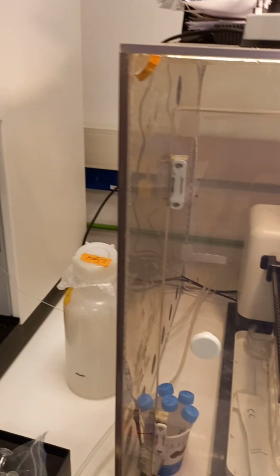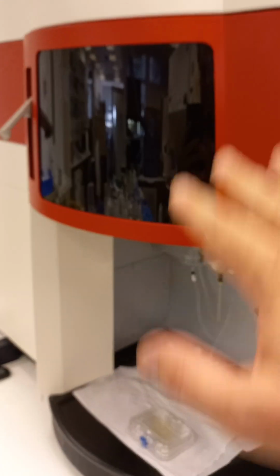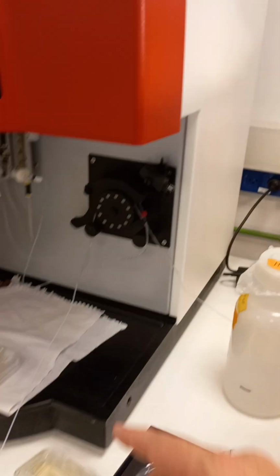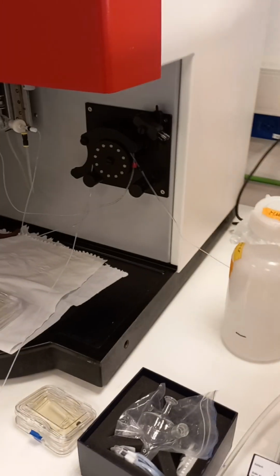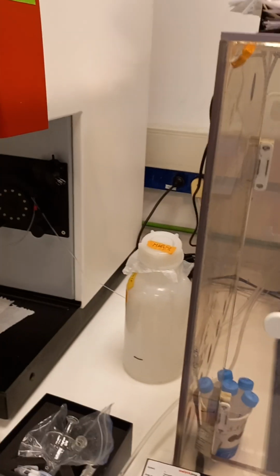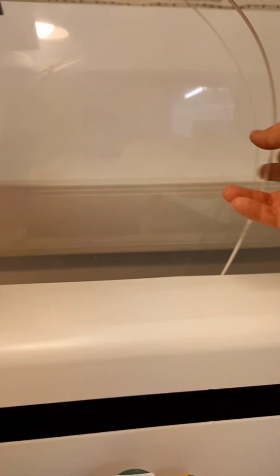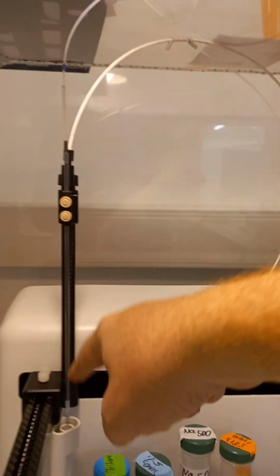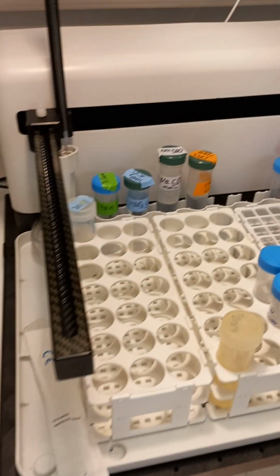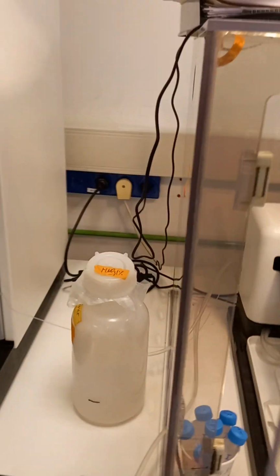And you should take into account that even if you washed and cleaned all the sample introduction system, and if you replaced these tubes, there is at least one long tube that you can't replace and put completely new every time you make maintenance. I mean this tube of the auto sampler. It goes there, it is pretty long, you see this here, and it is long enough to reach each part of this auto sampler, or maybe larger if you have a bigger auto sampler. And this tube is sometimes the source of memory effect.